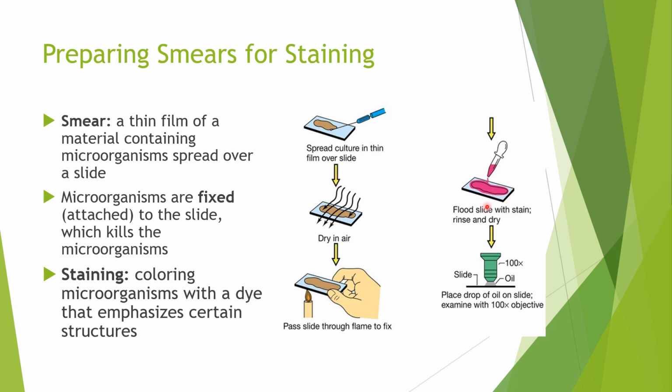You usually flood your whole entire slide with the stain. We leave it also for a few minutes. Each procedure is different. Some procedures are going to tell you you have to stain for a minute. Some procedures are going to tell you that you have to rinse it right away after 30 seconds. That's going to be discussed more in lab. And then you usually rinse it to remove the excess dye. So you just rinse with some water and then you blot it dry very gently.